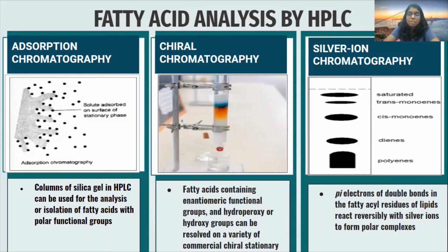The next one is silver ion chromatography. The pi electrons of double bonds in the fatty acid residues of lipids react reversibly with silver ions to form polar complexes. The greater the number of double bonds, the stronger the complexation effect.